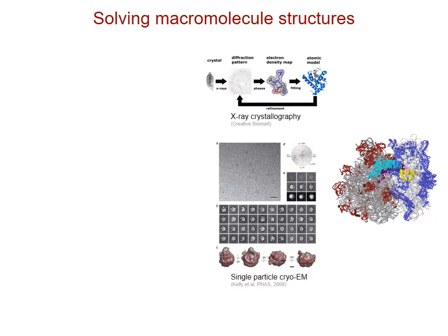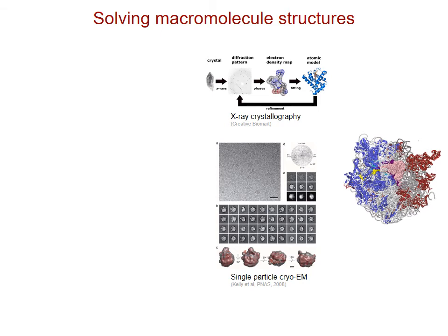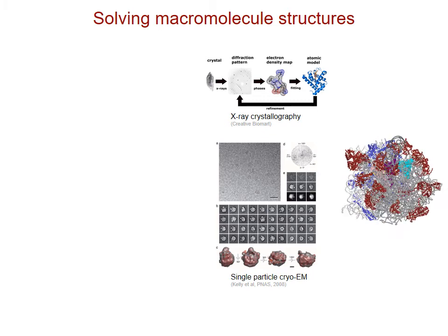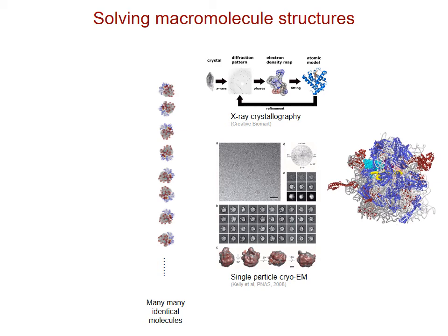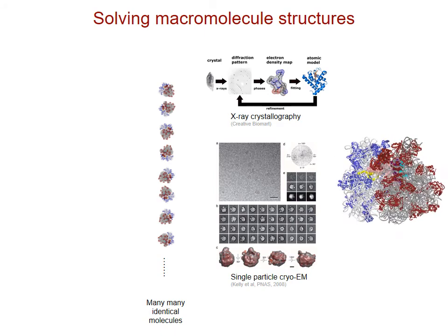These structures are often obtained through popular methods like X-ray crystallography or single particle cryo-EM. The input of such techniques is many macromolecules with identical structures.